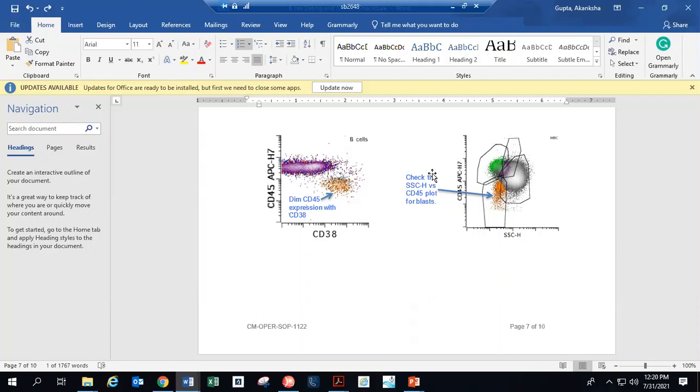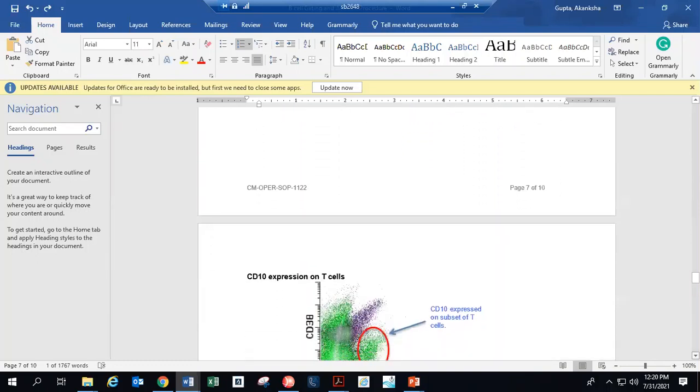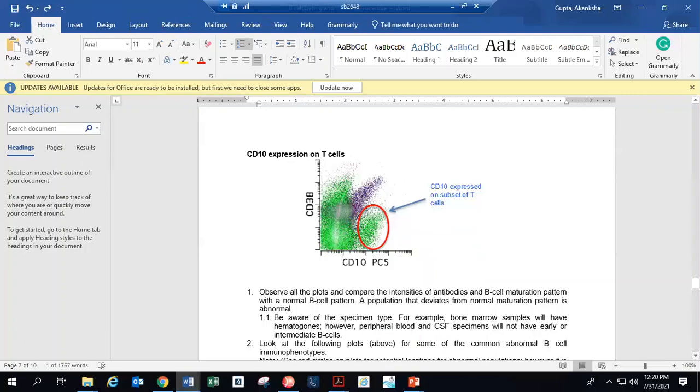In fact, where I am practicing right now, they also do TdT as a routine. If they are doing anything for acute leukemias, they will do an acute panel. They will do an intracytoplasmic MPO and intracytoplasmic TdT. These will be all the panels that they will add. So that's a routine practice. As I said, every lab is different.